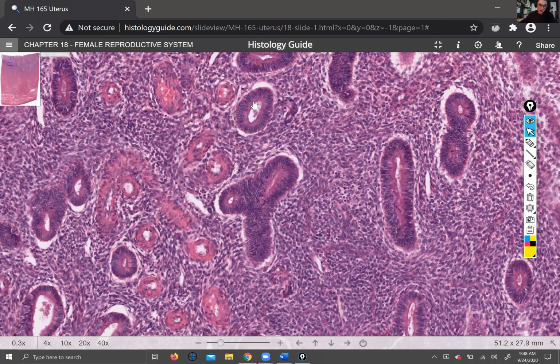You can see a pseudostratified epithelium here. So it's a columnar epithelium, it's pseudostratified, very, very thick. And all of these little holes just represent the fact that although this tissue has been sliced very thin, there are lots of little infoldings and tunnels into this rich mucosal layer.